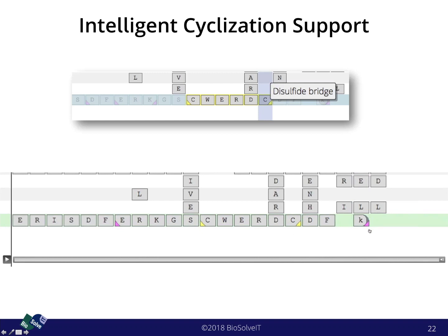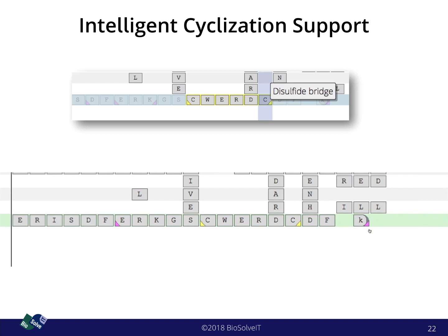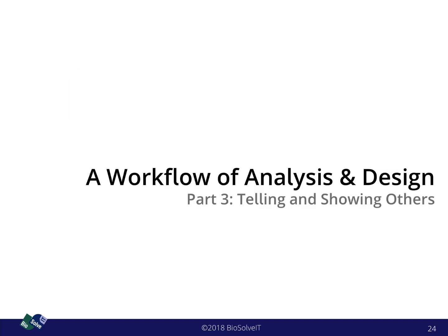This way we have a very minimalistic display, which does not disturb the tabular, very straight organization of the sequence view, and we don't have huge crossing lines above the respective amino acid entries that, how should I say, disorder our display of the sequences in PepSee.